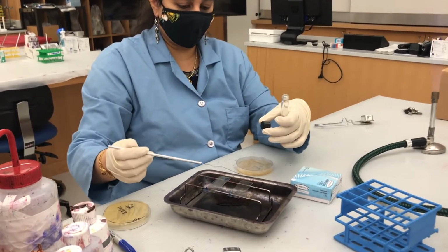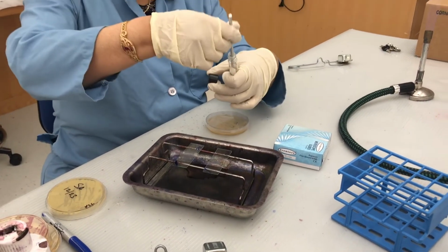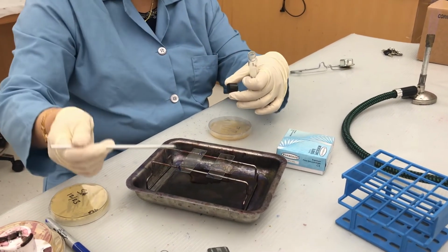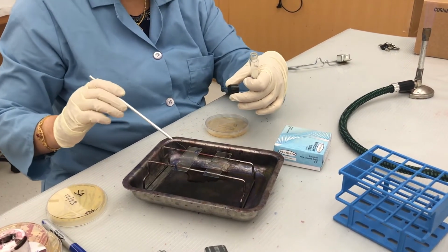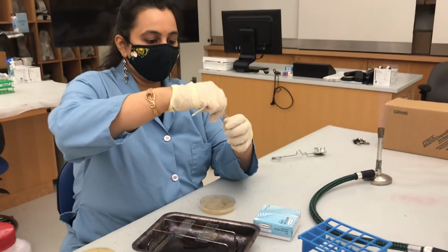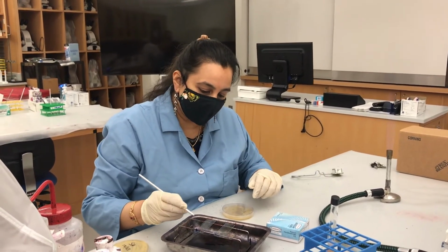So tap it. And I am going to add a few more loops just to make sure I have enough cells in the liquid. Alright, so I think I have enough cells. Now I'm going to close my liquid culture, put it here, and spread the liquid culture on the slide.